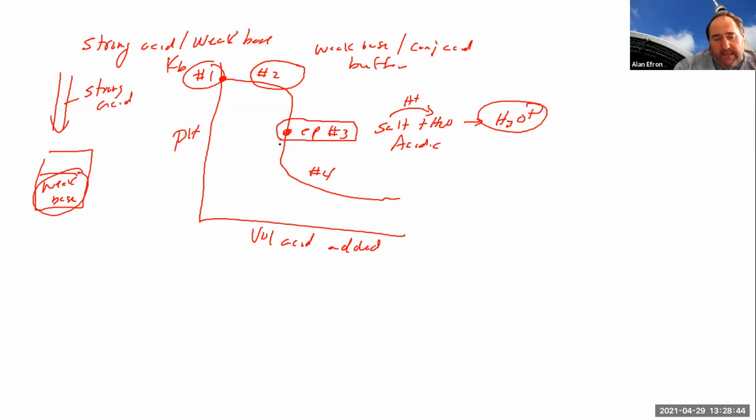And lastly, kind of similar in part number 4 here, differences since we're adding acid at this point, what we're essentially doing when we go past the equivalence point is just dropping a bunch of H plus in there, right, coming from our strong acid.